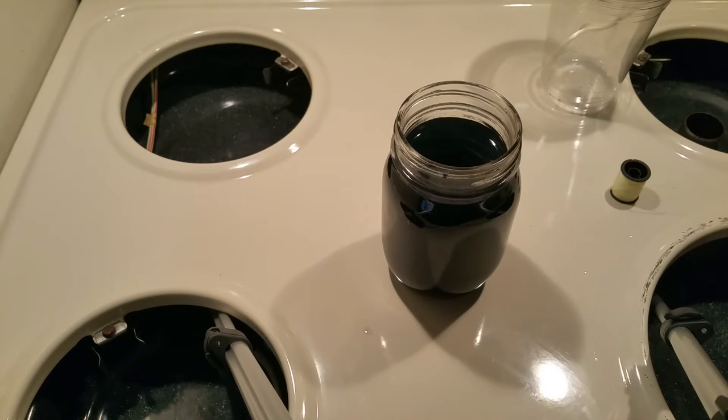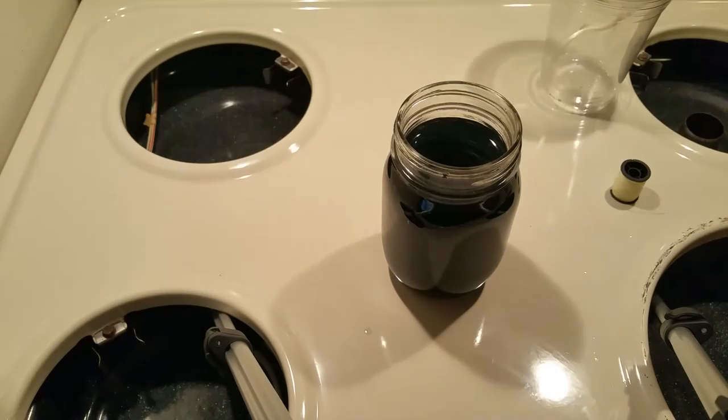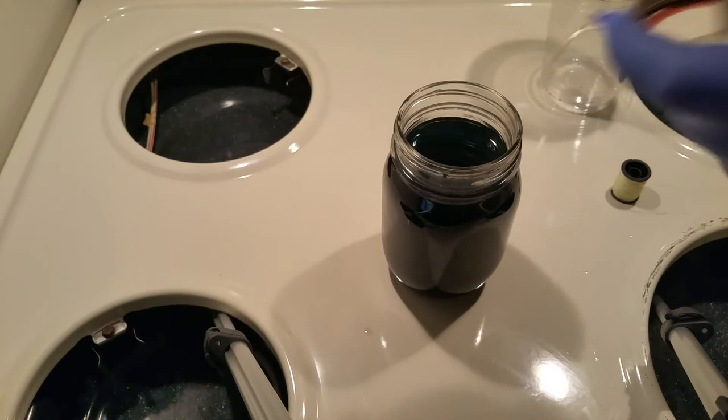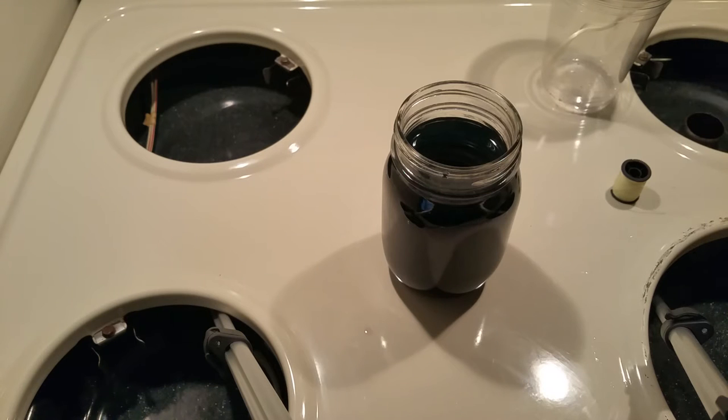Once everything is dissolved, we can put our beaker aside for about two days. This will allow all the excess salt to form onto a bottom layer of seed crystals. These seed crystals will then need to be separated out from your solution, as they will be the place where your larger crystals will grow from — your extra solute will form onto them, creating much larger crystals.